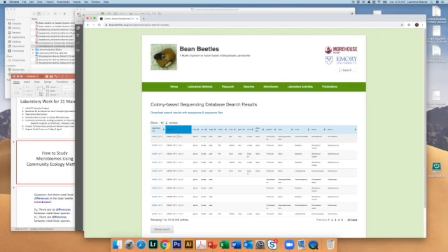These entries represent individual bacterial colonies that were picked by students at Emory. They did the NBLAST on those colonies after conducting polymerase chain reaction on them, and doing that NBLAST search on the Sanger sequence that was obtained, they determined what the genus was for each one of these colonies. We want to save these results.